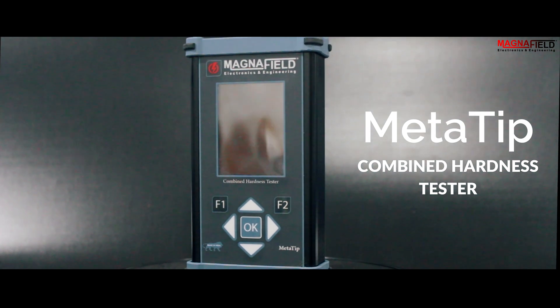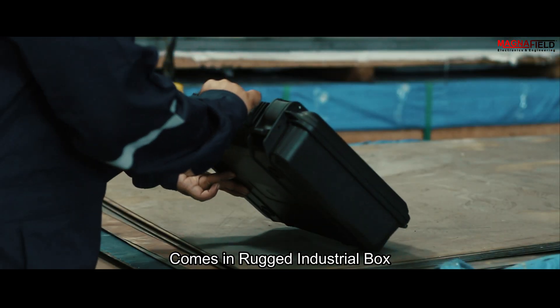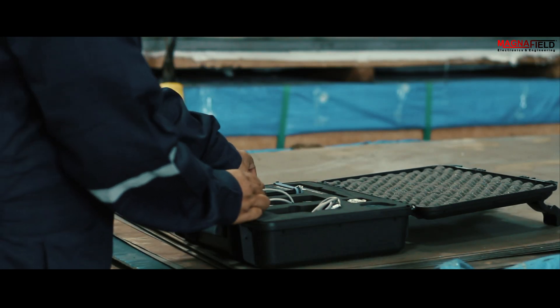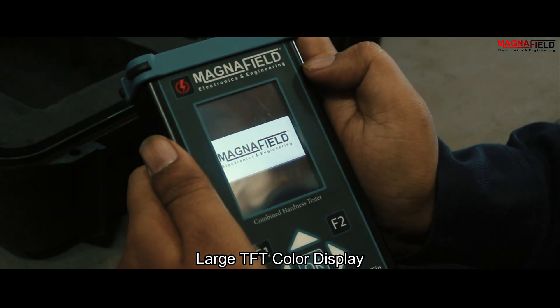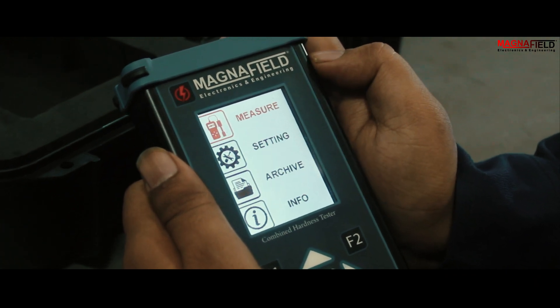This is MetaTip, a combined hardness tester. It comes in a rugged industrial box so that it can withstand transport and storage safely. It has a large TFT color backlit display to ensure clear visibility in various lighting conditions.